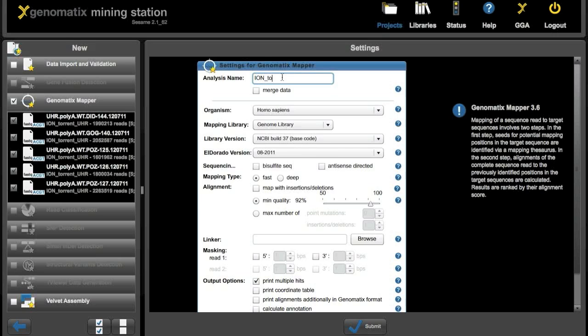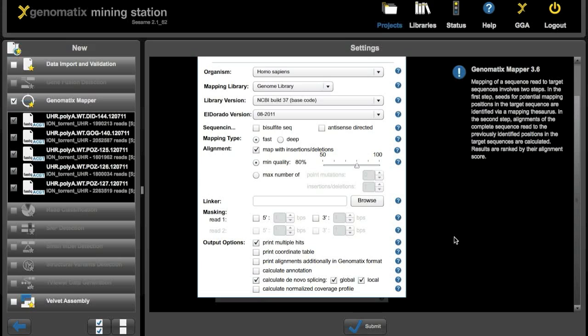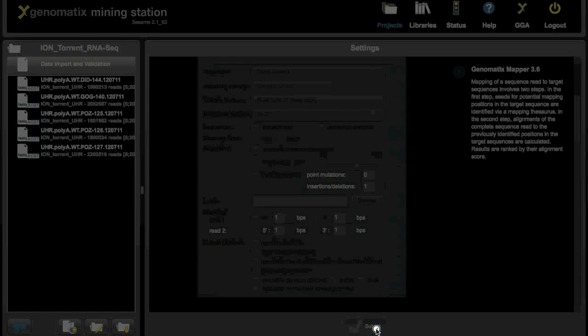We start out with the name again. Ion Torrent UHR. We want just one result for all the files we selected, not one each, so we click merge data. And for the PGM it's best to map with insertions and deletions, to set minimum mapping quality to 80%. Down here we leave the defaults to get multiple hits for reads and to calculate de novo splicing.